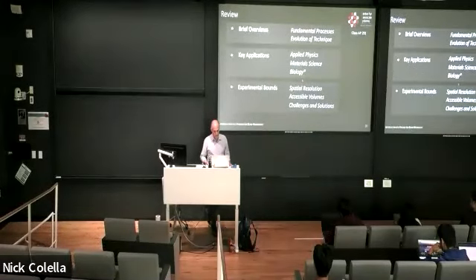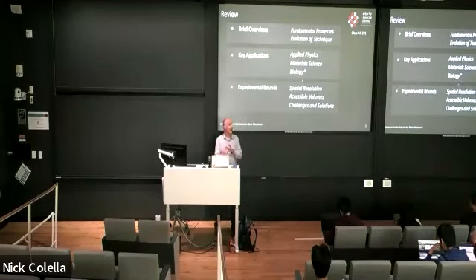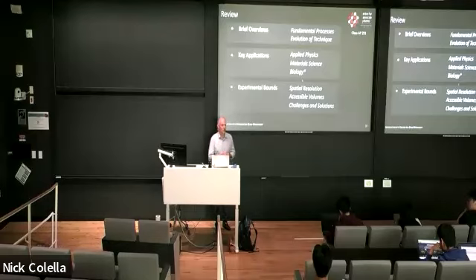So with that, I'm at the end of the talk. I hope I could give you a sense of how you can use these focused ion beams to machine your material, prepare samples, to extract samples, what the characteristic dimensions are, and how you can use it for different applications. And with this, I'm happy to answer any questions.